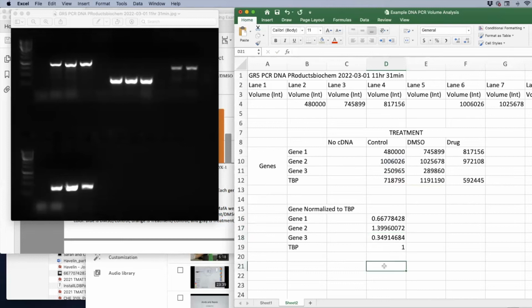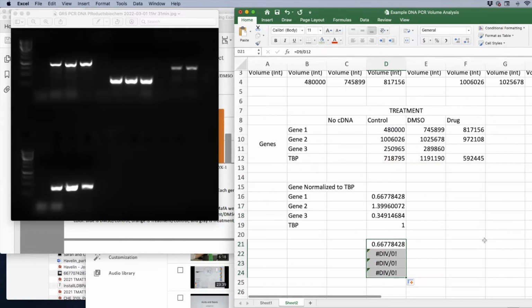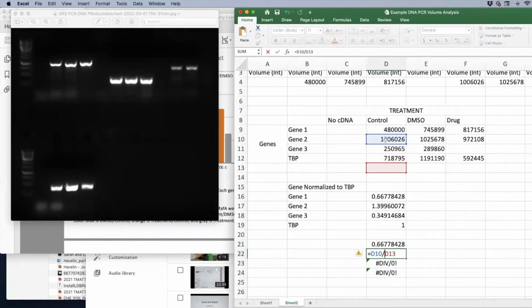Let me show you guys what happens if you don't lock it. Okay, so I just typed the same formula, this divided by this, but I didn't put the $ signs in. So if I drag down, now I have all these divided by zeros. So again, the original box, this divided by this, the one box below it, like I said, it's basically shifted both cells down one now, because by copying it, I'm telling Excel, use the same formula, but shift down. And then this one is 2 down.